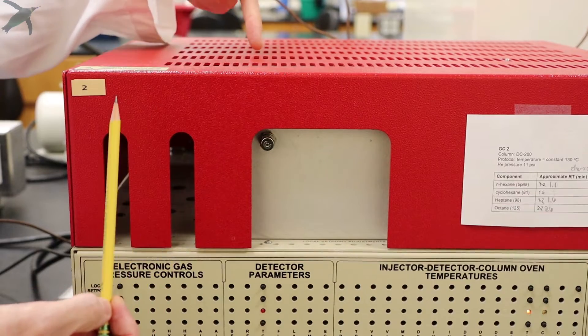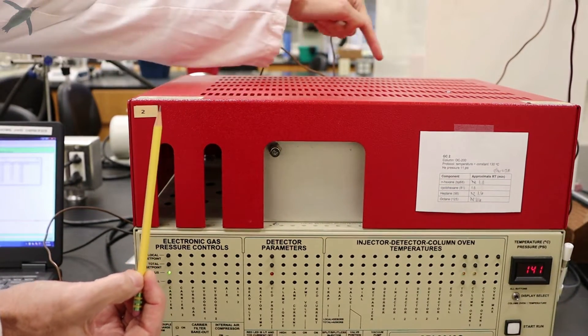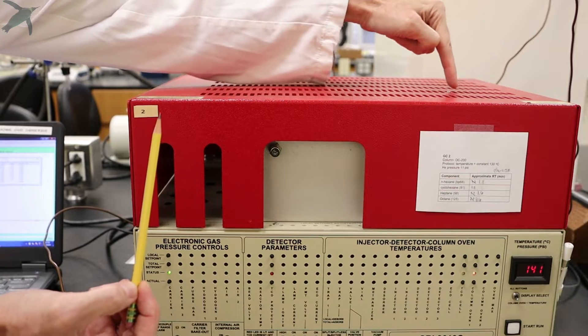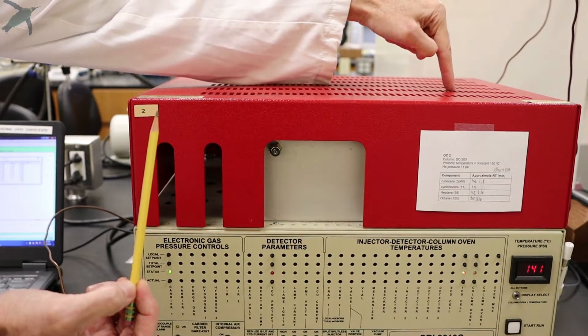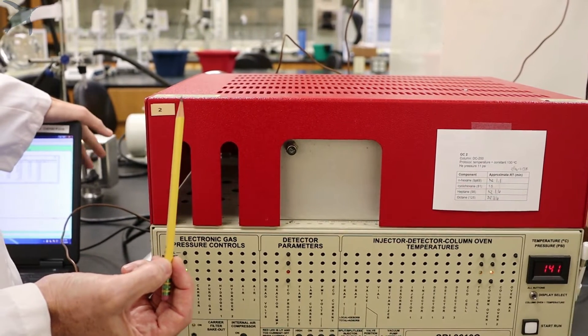Your sample goes in this way, the column winds up in this direction, and ends up here where the detector is. The detector will detect the signal and send it out to the computer for processing and display.